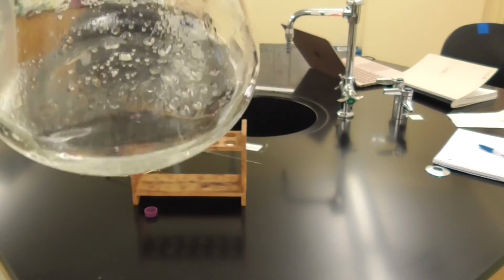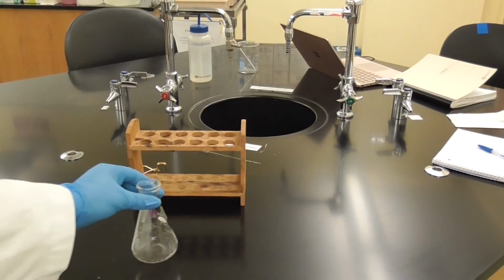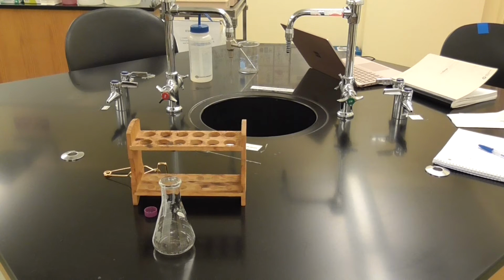Very, very low. Right, it's volatile. So you have to be careful when you put it on the hot plate, because sometimes if it is too hot, it is going to burst into a flame. So we have to be very careful with that.